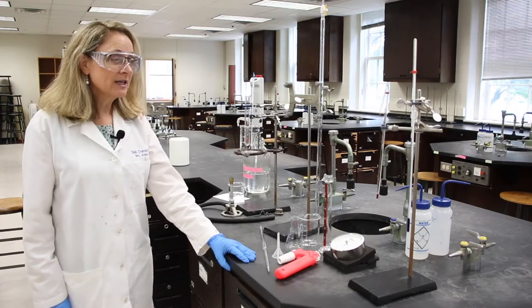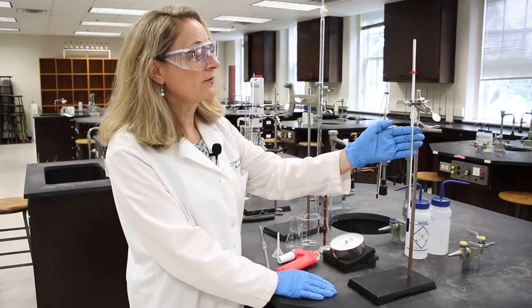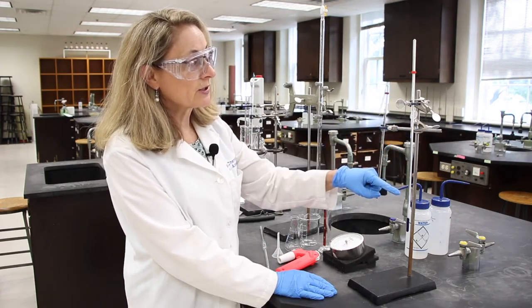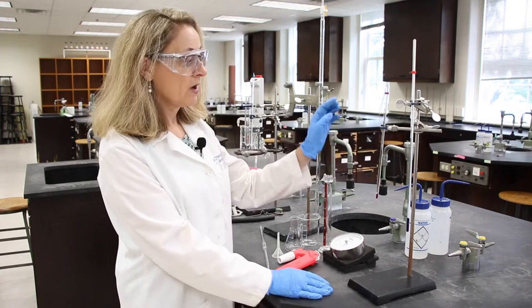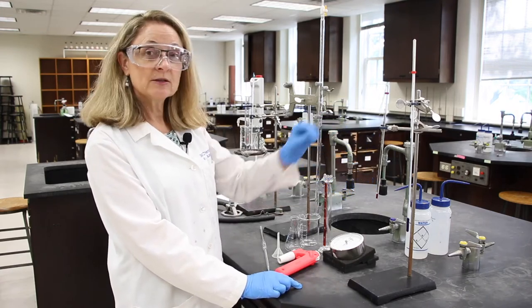First, let's look at our thermometers. We have two different kinds of thermometers. We have one that reads from 0 to 50, and one that reads from about minus 20 to 100.